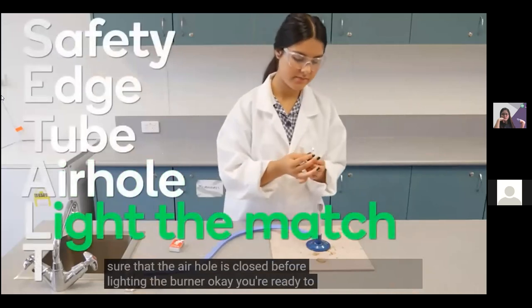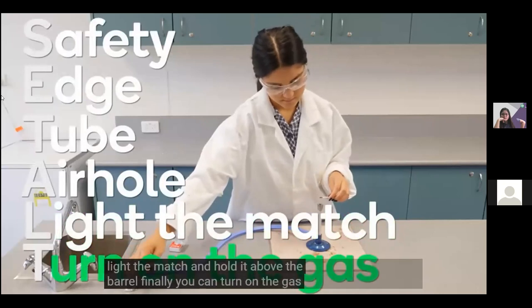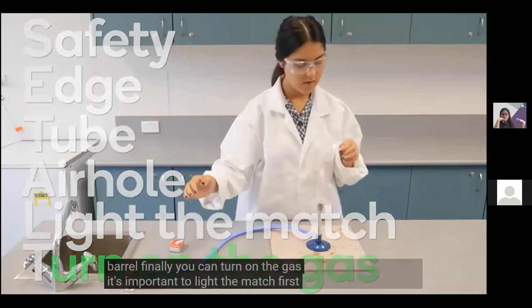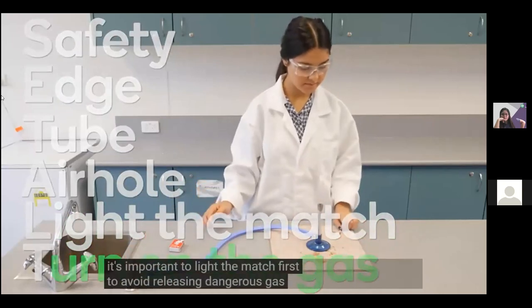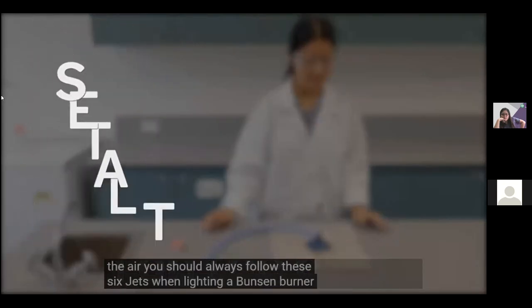You're ready to light the match and hold it above the barrel, then turn on the gas. It's important to light the match first to avoid releasing dangerous gas into the air. You should always follow these six steps when lighting a Bunsen burner.